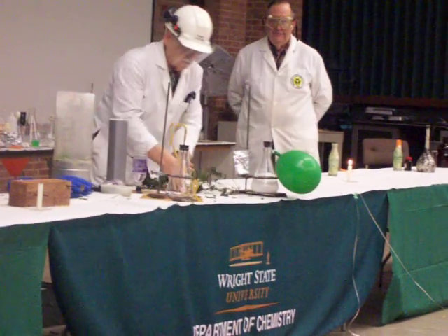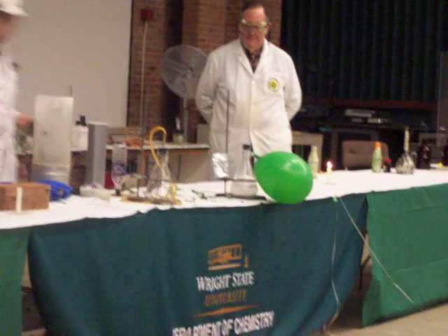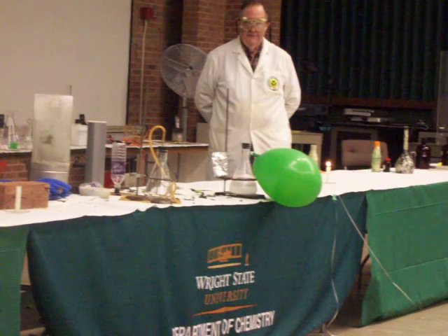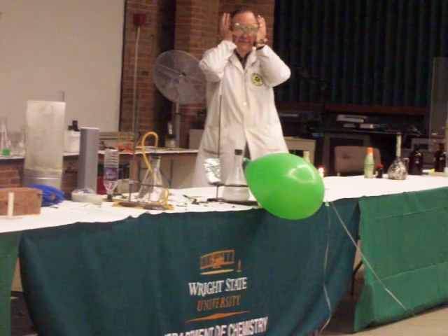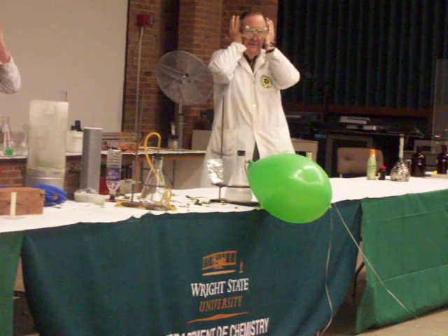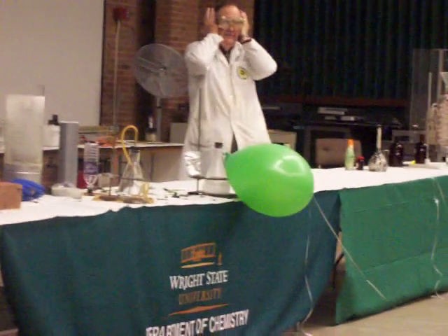Now, I'm never quite sure when I do this demonstration whether the balloon will blow up first, or whether the pressure will build up high enough initially to blow the stopper out. I'm not going to take any chance, so I'm putting on my gear protection and stepping back here.